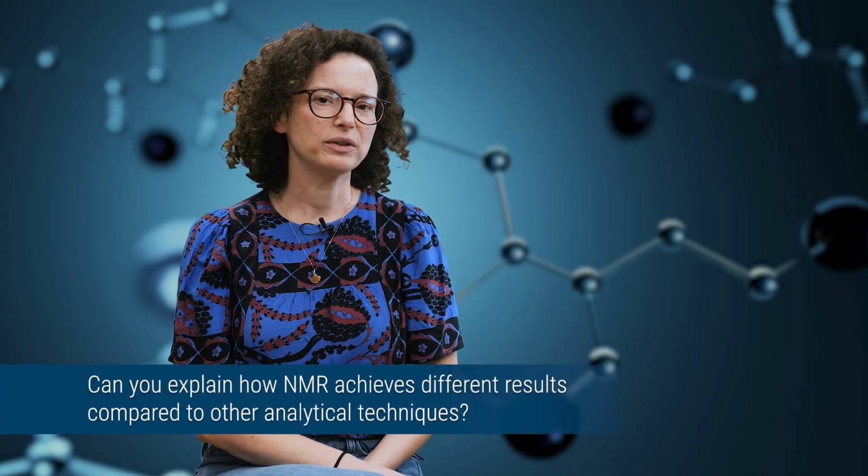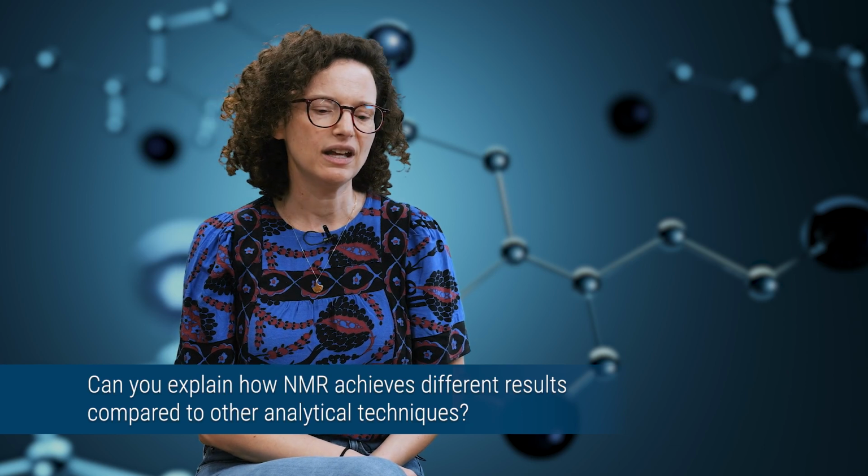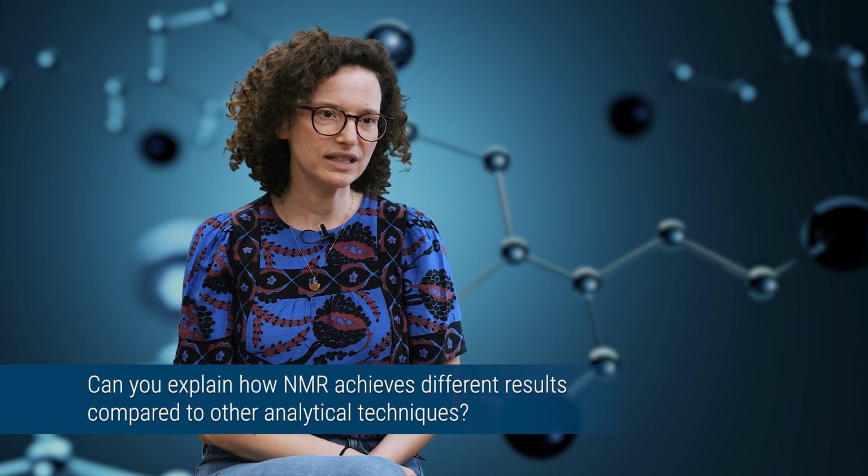And for that, we need to be able to detect these ions and detect the chemistry within a battery cell. So for that, we use solid-state NMR spectroscopy. A lot of the chemistries that we are trying to detect have very low quantity inside a battery cell, so we also have to somehow enhance the sensitivity of solid-state NMR spectroscopy, and we do it with an approach called Dynamic Nuclear Polarization. The main approaches in magnetic resonance that we are using are solid-state NMR spectroscopy, and we increase the sensitivity using dynamic nuclear polarization in the solid state.